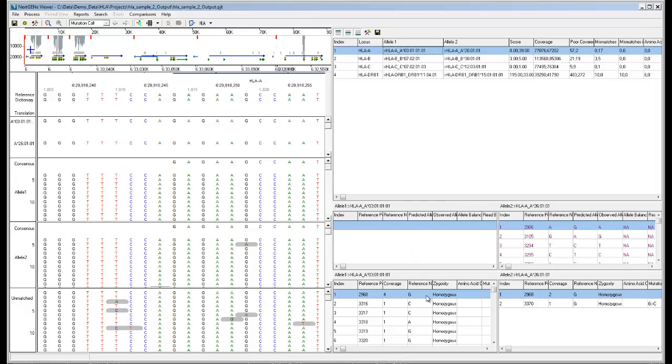At the bottom, the allele coverage report lists low coverage regions as defined in the HLA report settings for the selected alleles.